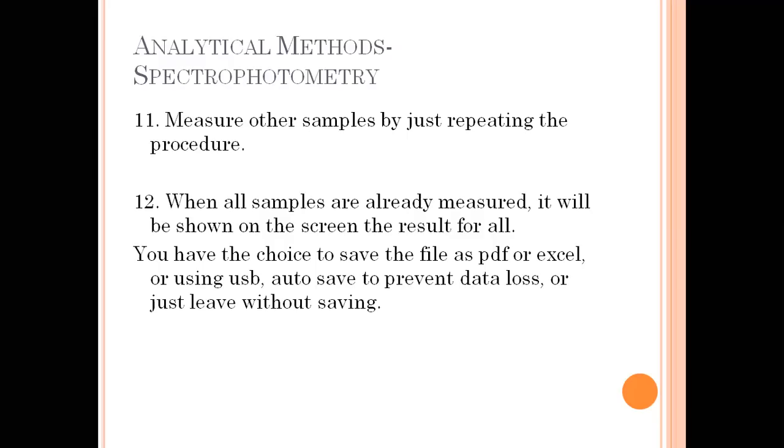But in a real setting, in private labs or in hospitals, it's very important that you save the data, or you save the absorbance you made for that day. Because that will serve as your reference or basis for whether what you put in and what you used for the computation were correct, to produce this result. Okay? So again, after using the spectro, you only have the absorbance reading.